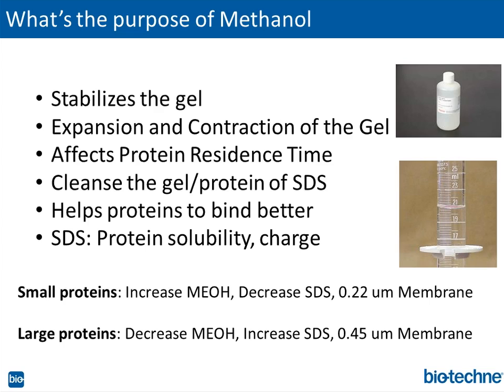By the way, I'm going to show you a paper where they try to transfer a 480 kilodalton protein and how they manipulated things to get that to happen. But by lowering the methanol, you expand the gel with more water, less methanol, and allow the pore structure to open up and allow the protein to come out. So that's the basic rule.